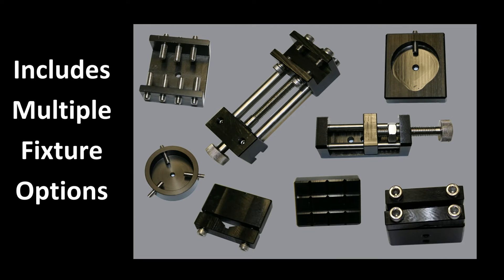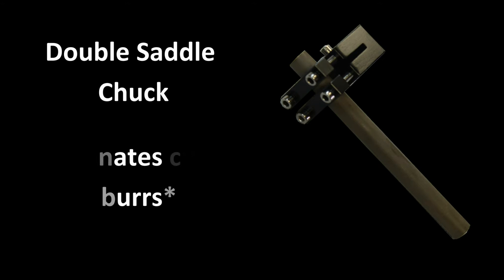What makes the Pico 155 such a versatile cutting machine is the wide selection and range of vices that come standard with the wafering saw. These include the double saddle chuck, which is used to adhere the sample on both sides. This eliminates the cutting burrs that can occur when fixturing only one side of the sample. For ceramic samples, this is very useful.